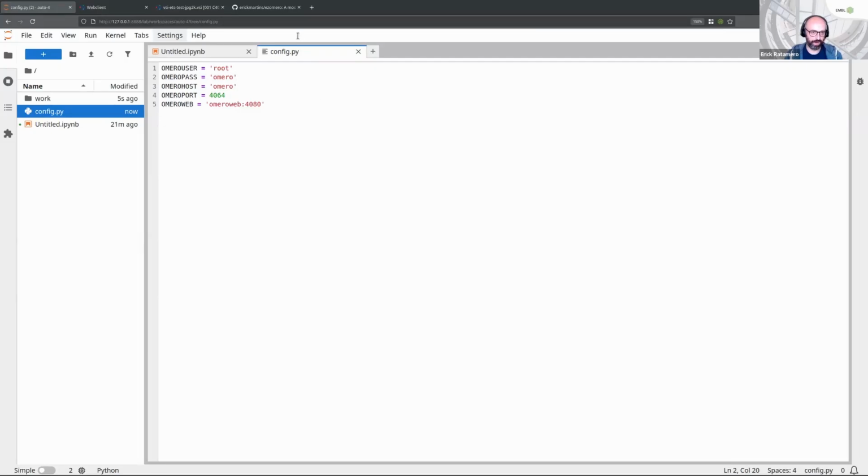In general, when I'm writing code that does things, I have this as a local file in my GitHub repository, for example, but I do not commit it. I make sure that it's added to gitignore, so that it's never committed to the repository itself, so that no one ever has access to the secret stuff. As I said, I have no reason not to show you in this case. If you are using the Docker Compose following the setup instructions that I had for the workshop, you can use this config file exactly as it is here. You don't need to change anything. It's just going to work.